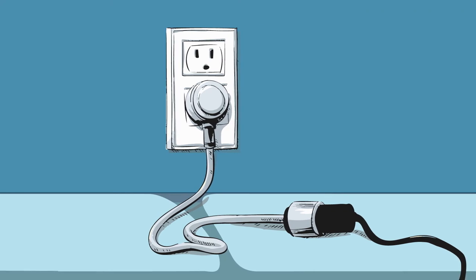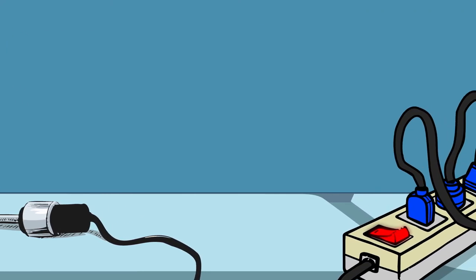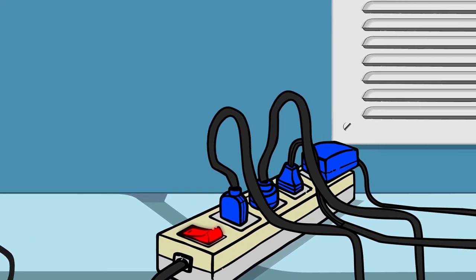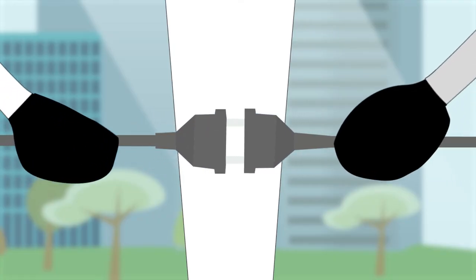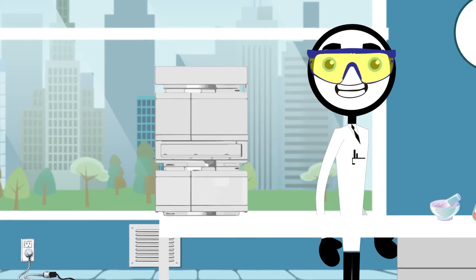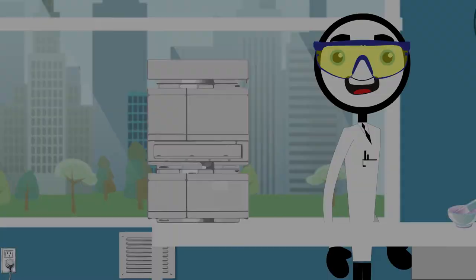Chris did not have enough available outlets to designate a single outlet for each module in his LC, so he added a power strip and plugged all his devices into it. But he still needed an outlet for his computer, so he added a second power strip. Since he had a few more available outlets, he added a sound machine and a fountain to his desk — to add to that spa-like ambiance. This worked for about 20 minutes. Then he tripped the circuit for his entire building.